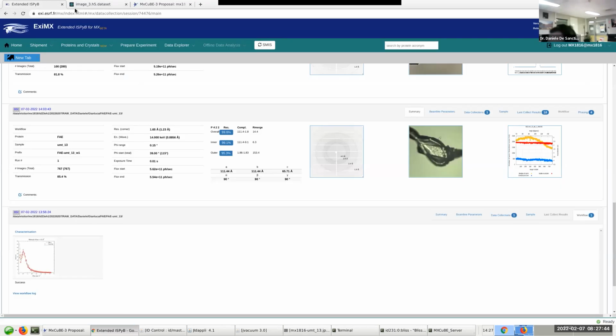Okay, so Carlos, right? No, there is no way to download everything at the same time, because it's too much data to go through HTTP, of course. But to answer your other question, the process data stays in basically forever. It's just a bit tricky sometimes to access it, but you can ask for support to do that, or you can resync. So the easiest thing is probably if you use a syncing script to recover your data. Some auto processing will arrive a bit later, so let it run a bit longer than the end of the session.